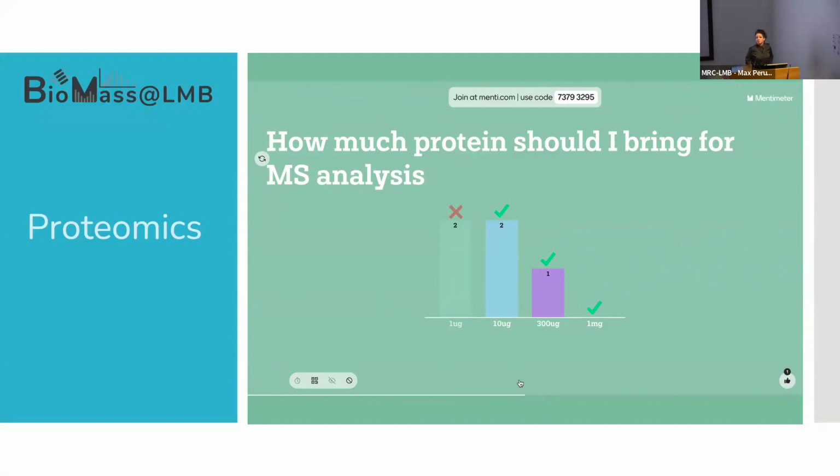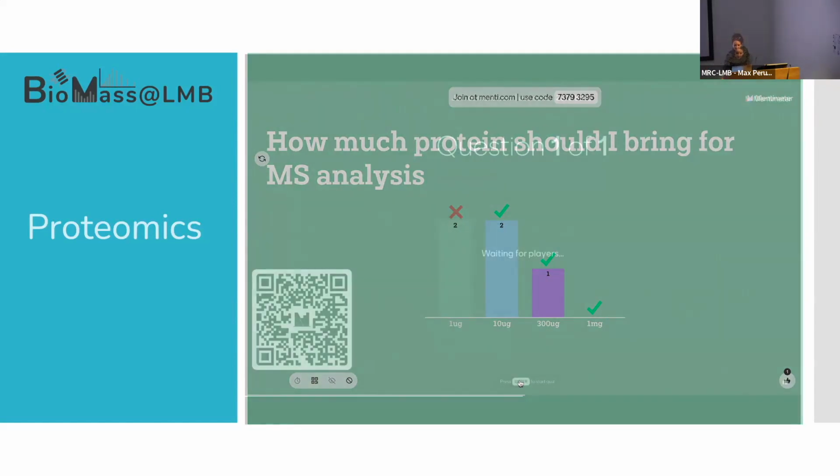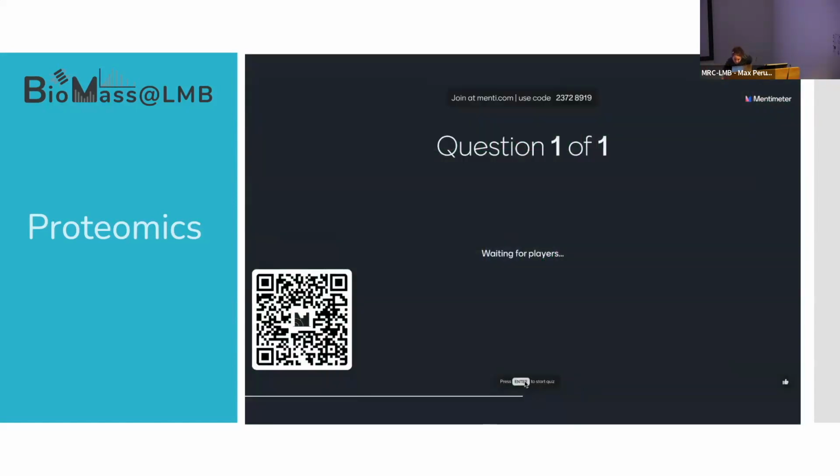But if you want to work in characterizing post-translational modification events, such as phosphorylation, then we actually need to drive this number up. We multiplex your samples, we end up with a lot, but then we have to enrich for phosphorylated peptides. So this means that you have to start with a large amount in the beginning. And the last one.